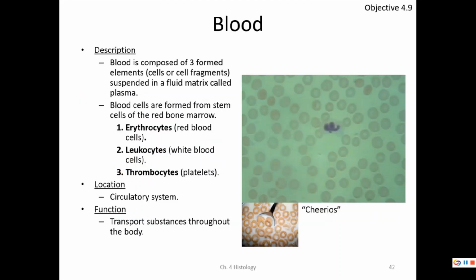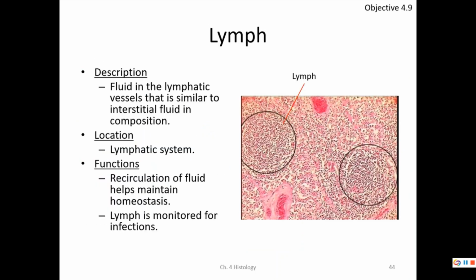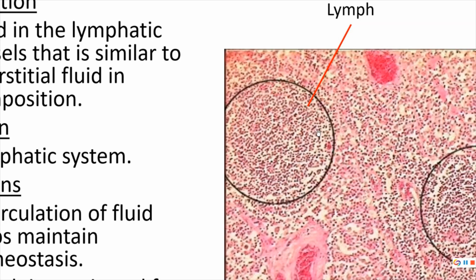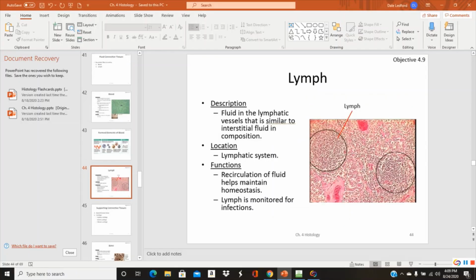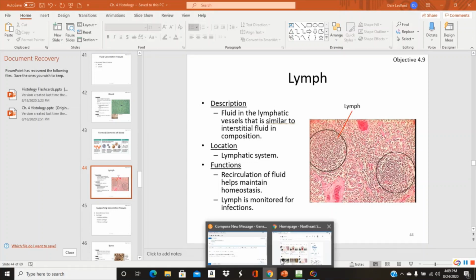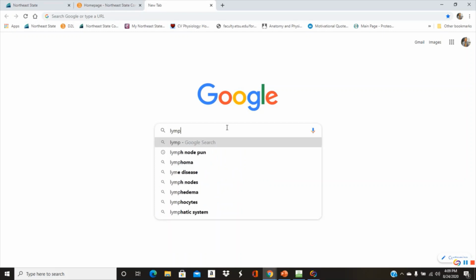Now, blood, as we said, has those cells in it, okay? Lymph, now this is actually in a lymph node, but these are a bunch of lymphocytes, and they're really small. I really would want to actually have lymph, where you would take a lymph node, even a lymph node aspiration. You can actually sometimes see that. I'll do that kind of quick.